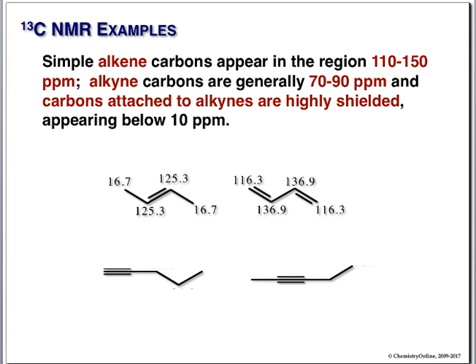Triple bond. Triple bond carbons are shifted the least of our double and triple bond group. One exception, of course, was the nitrile. Remember, that was around 100 or so. That shifted a lot. Here's a simple triple bond, and I particularly want to show you this effect.